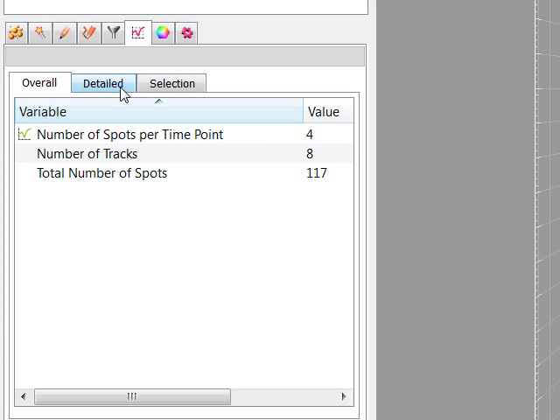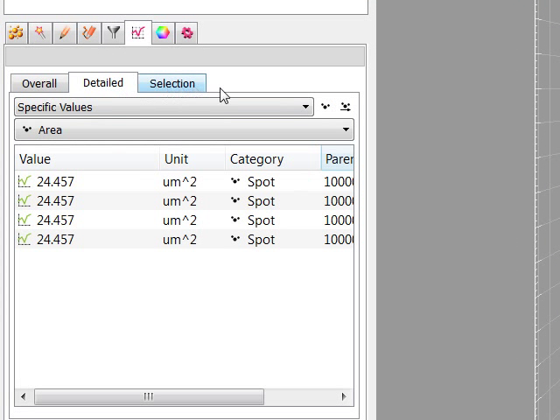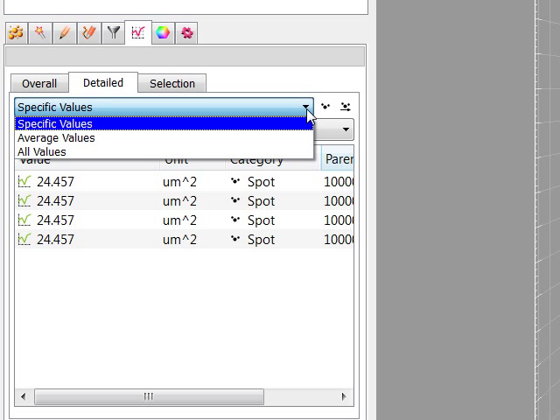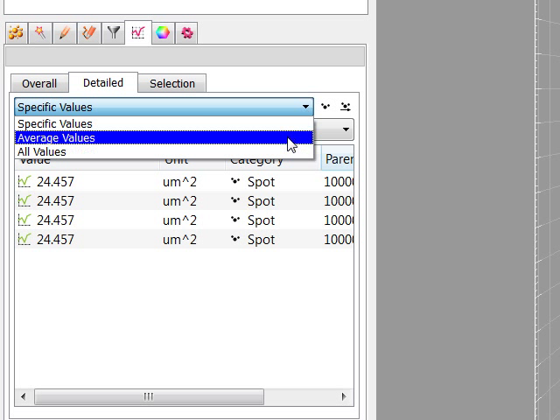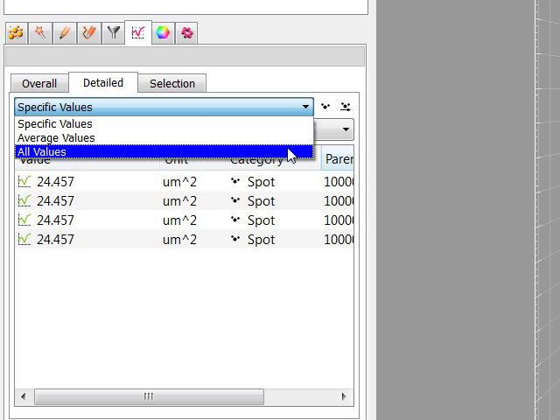Under the Detailed tab, the pull-down list provides three types of statistical calculations – Specific values, Average values, and All values.